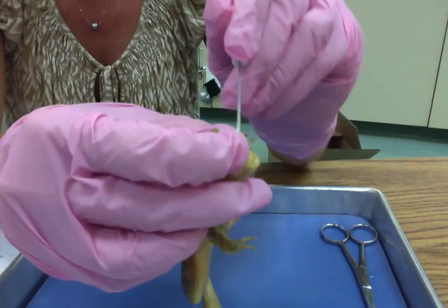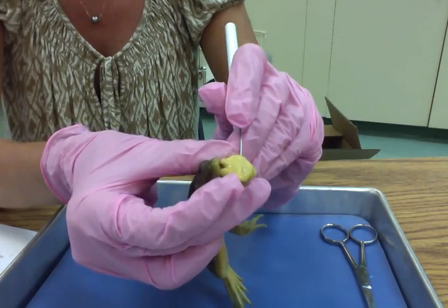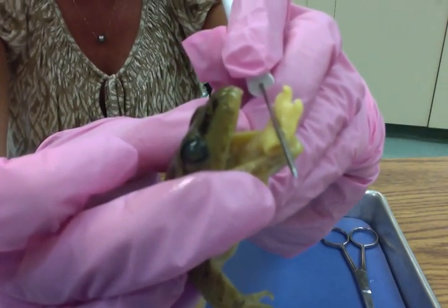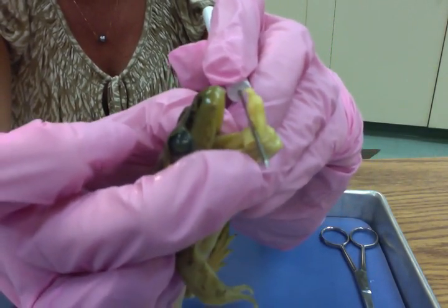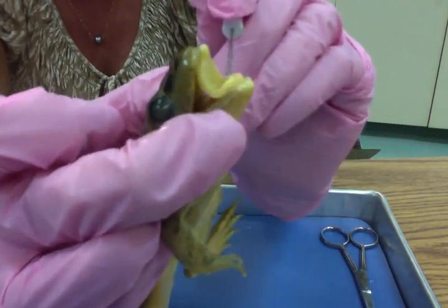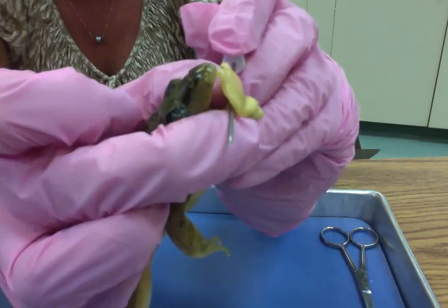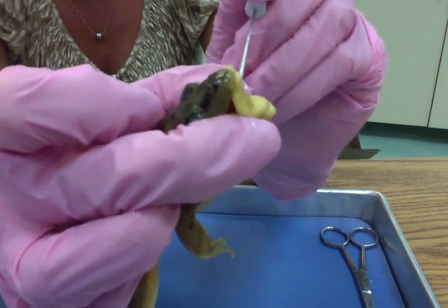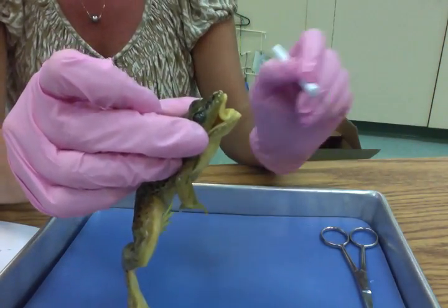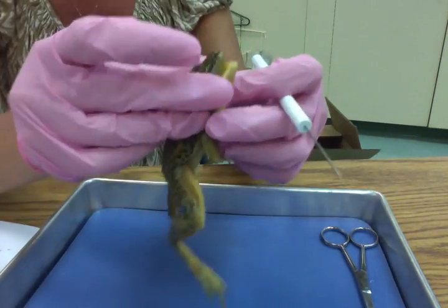So you see how the tongue is connected to the front of the mouth, and obviously when the frog is alive and there's juices flowing throughout the body, this muscle is much more flexible and stretchy, and so that tongue can expand way out to catch a bug, you know, over here or something. So let's put his tongue back in the mouth.